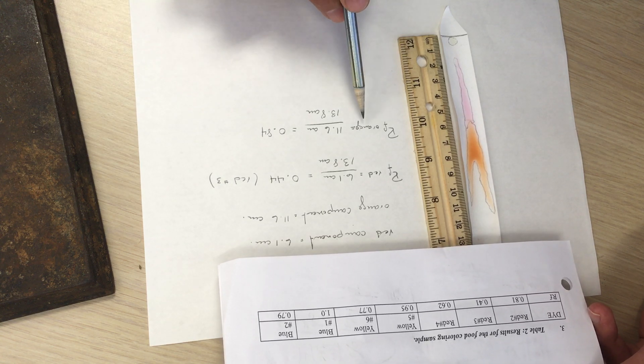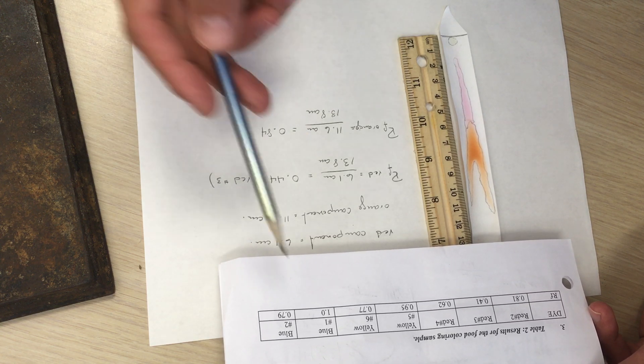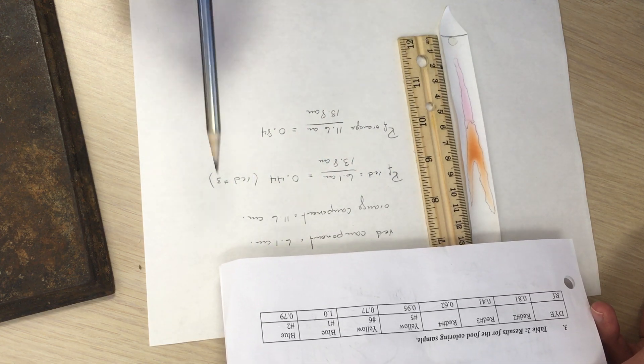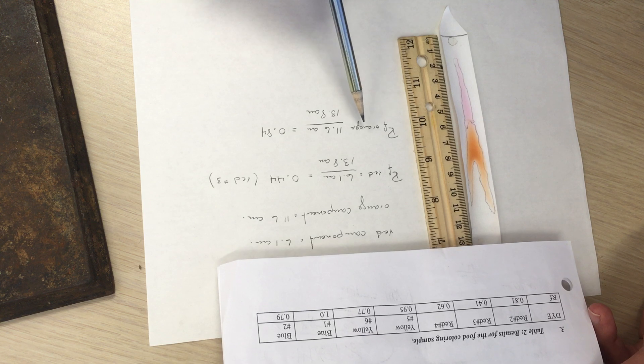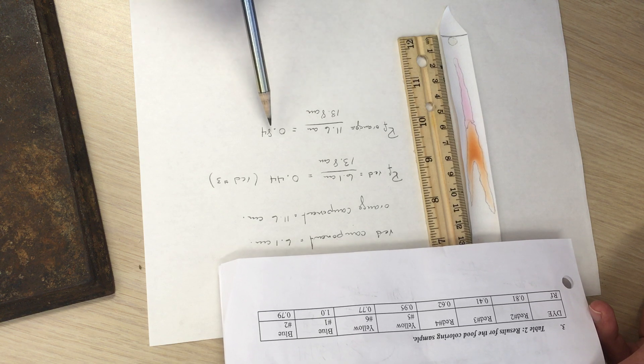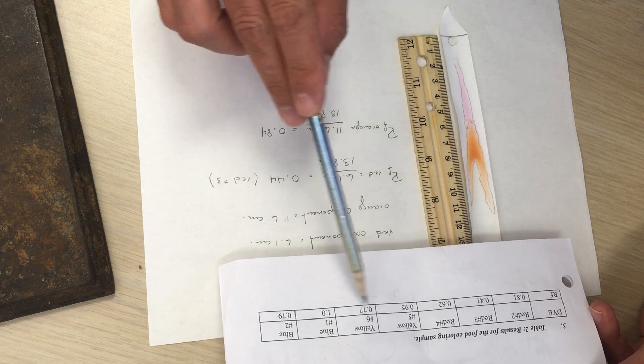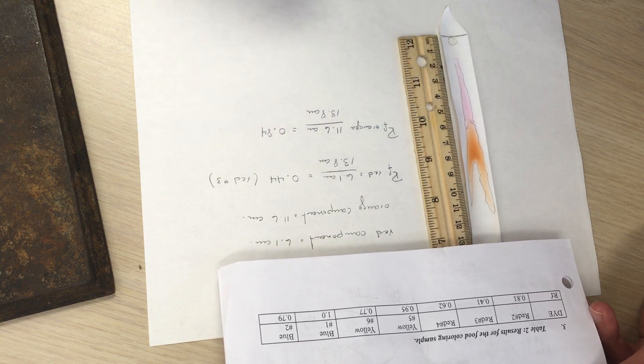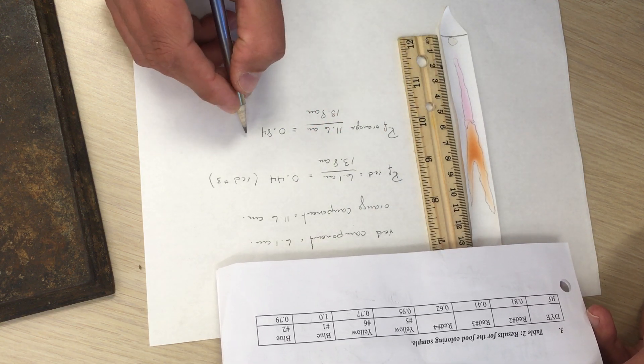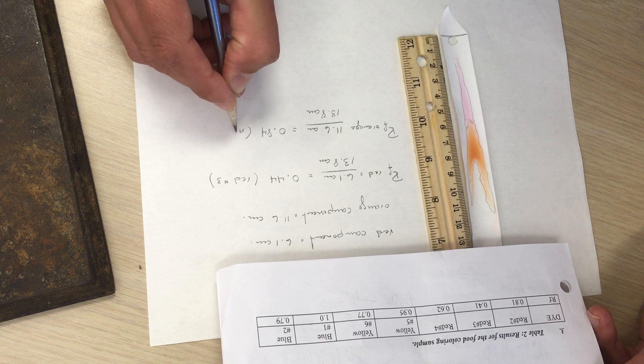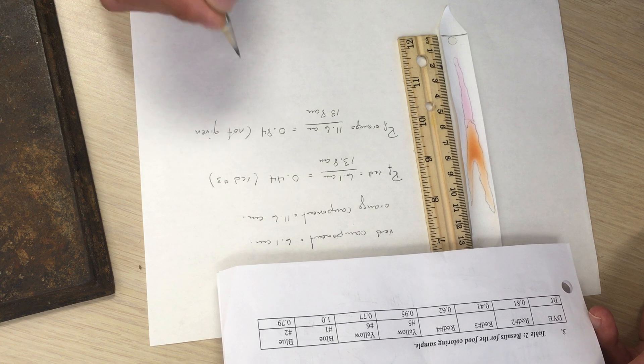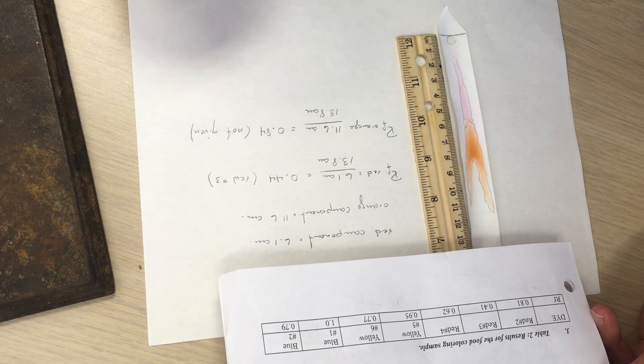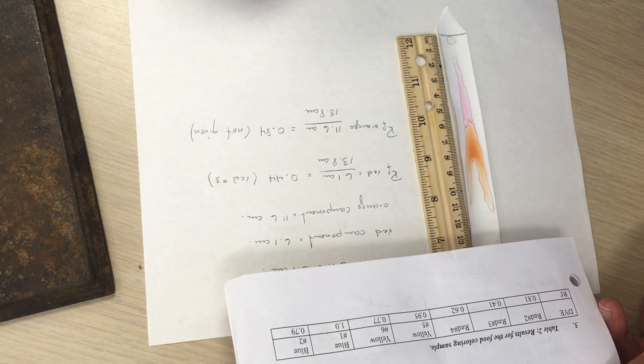And for the orange, well there's no orange color in the given list. We could assume that maybe it's a shade of yellow. And really 0.84 is not near the yellow number six or the yellow number five. So this is not a given choice of food coloring.